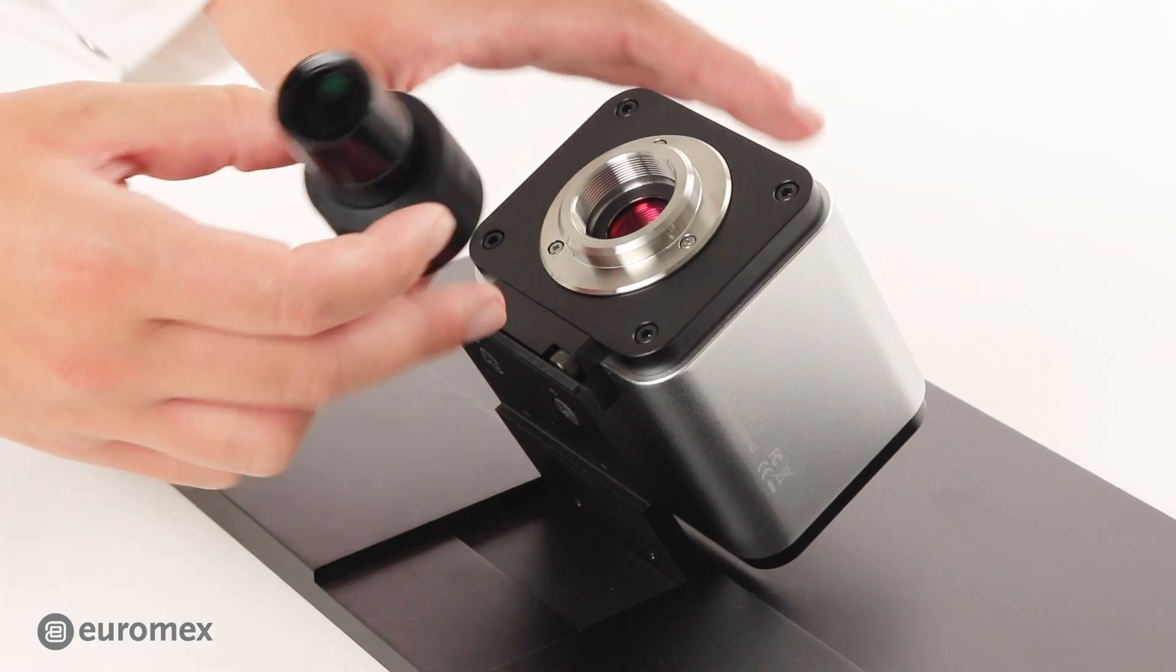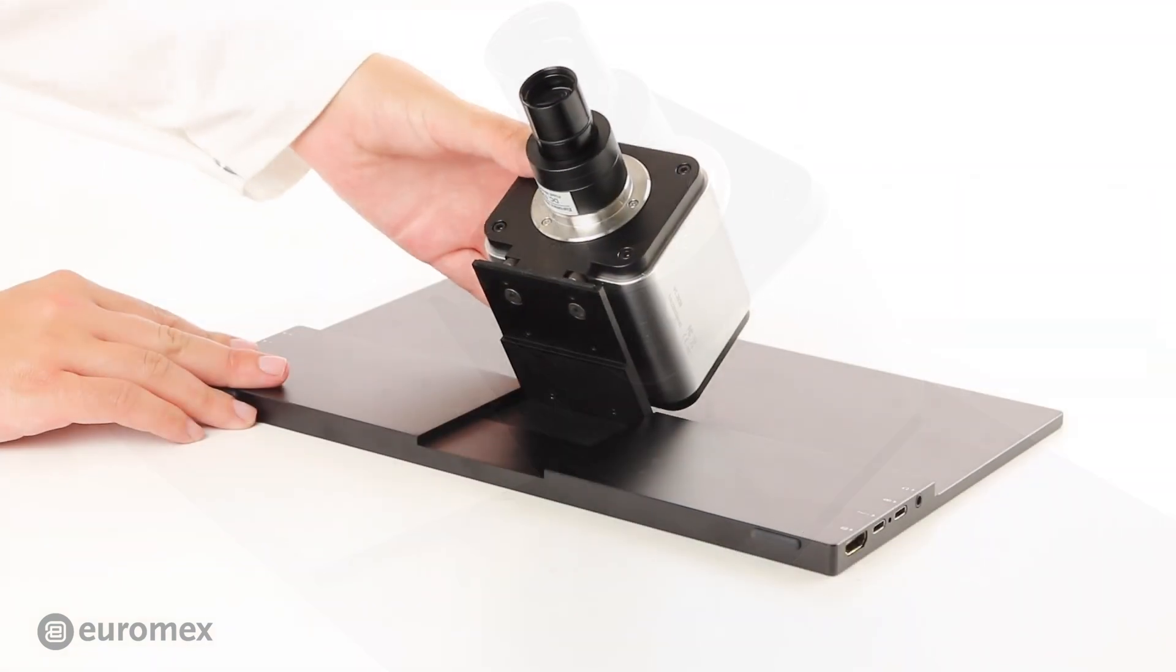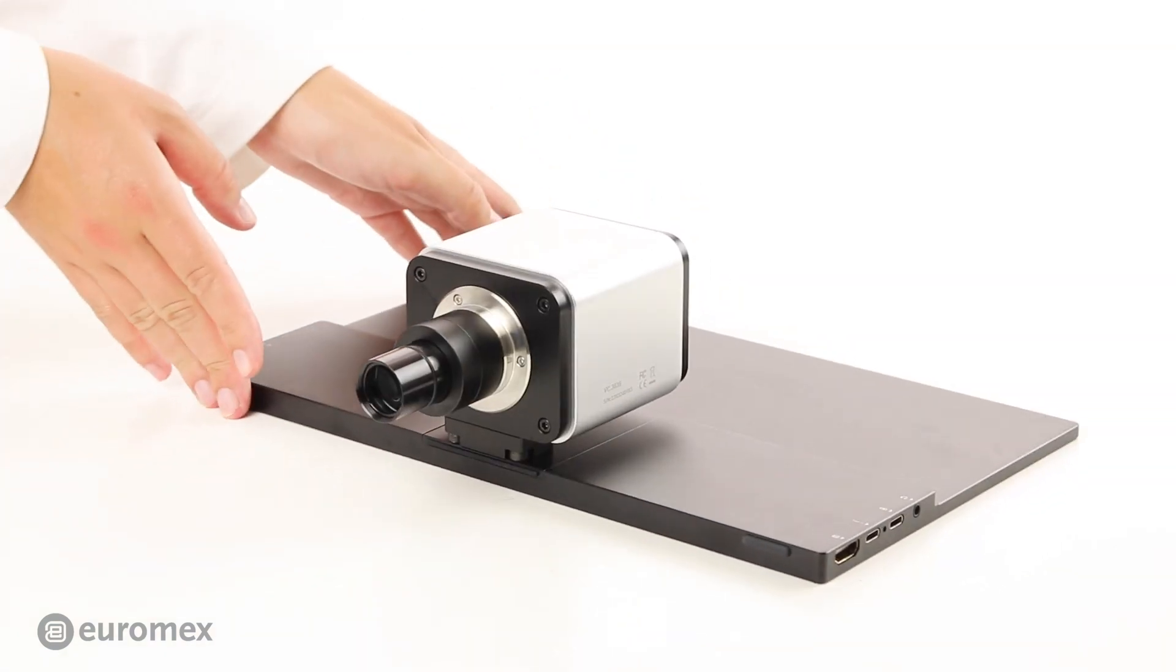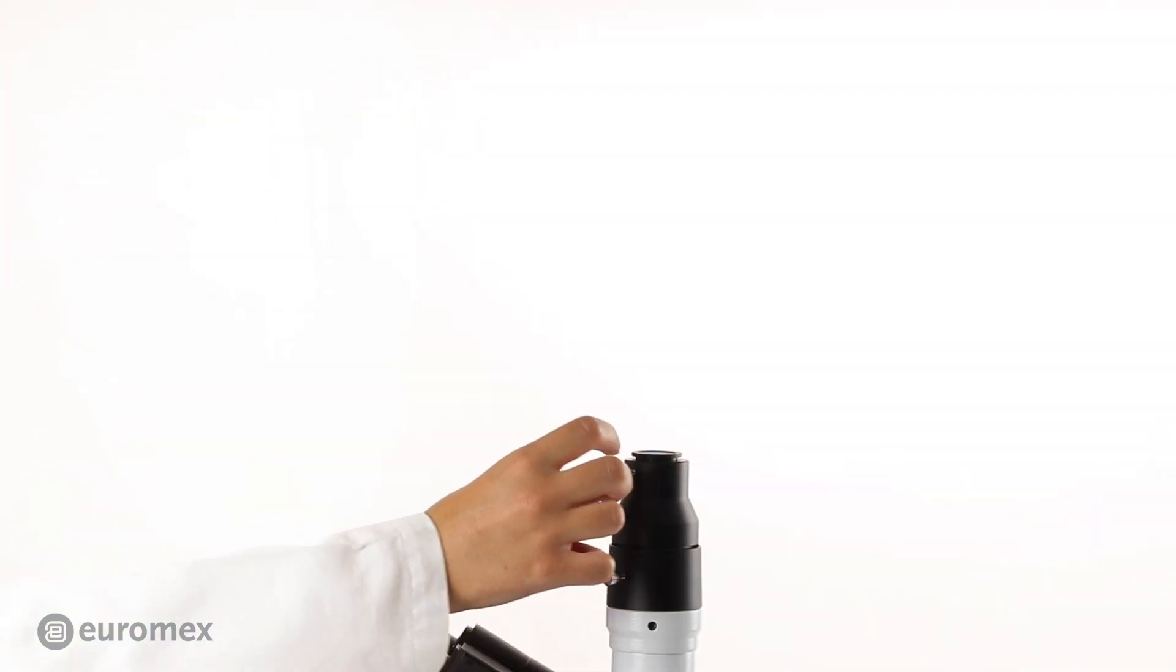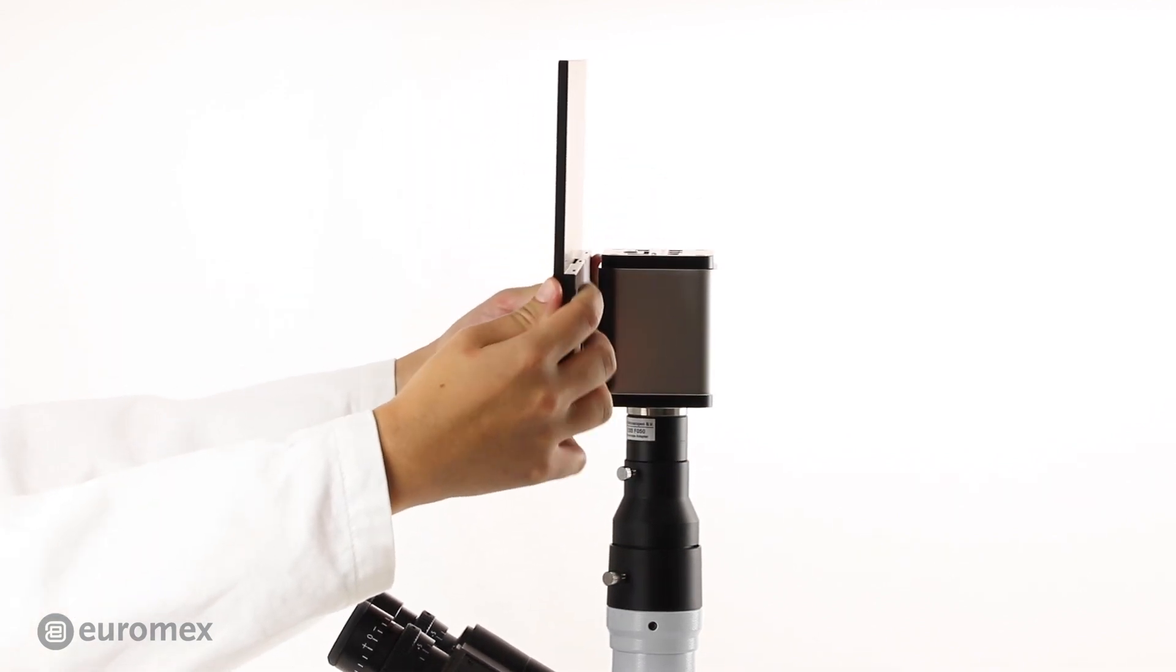Attach the included C-mount adapter to the camera. Remove the dust cover of the photo tube. Place and fixate the camera.